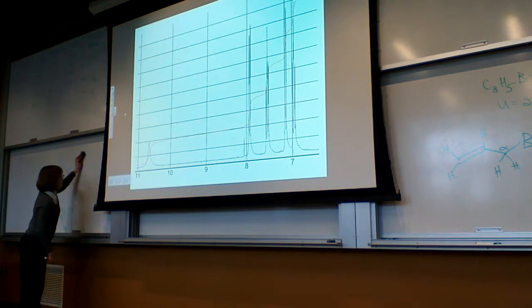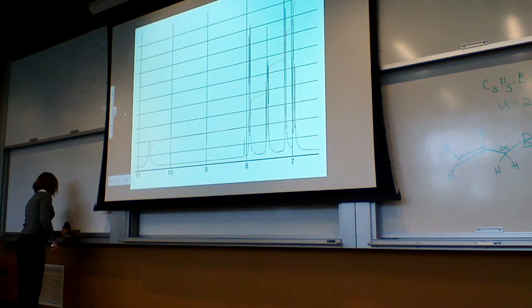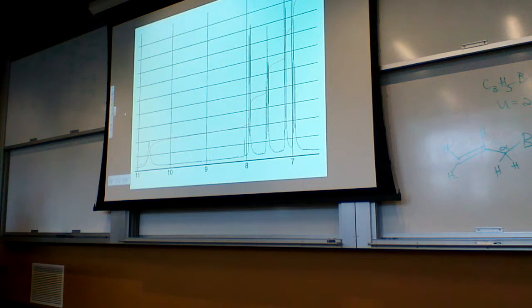And we'll make up a little table the same as we have. The molecular formula for this is C6H5ClO.